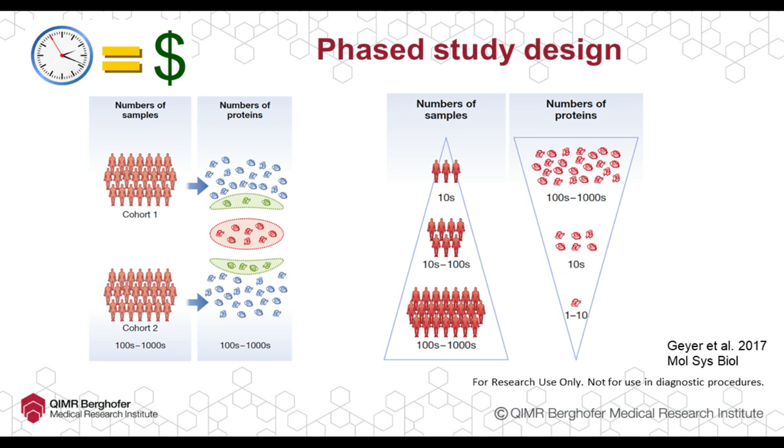And often one might design an MRM assay to very accurately quantitate the small subset of candidates. This can then lead to an even smaller subset, although MRM assays can measure around 50 or tens of proteins, so it may not need to really go into an antibody-based stage towards the end.